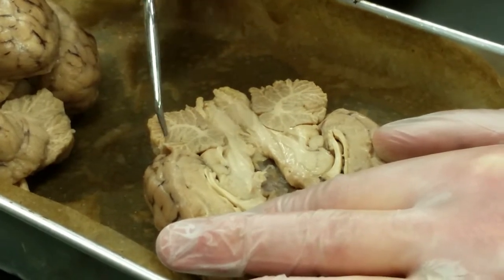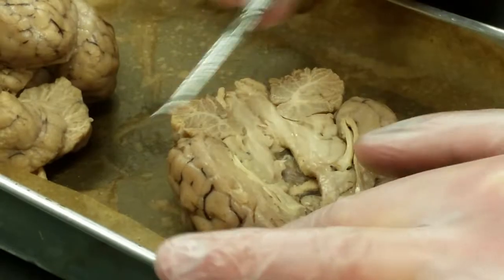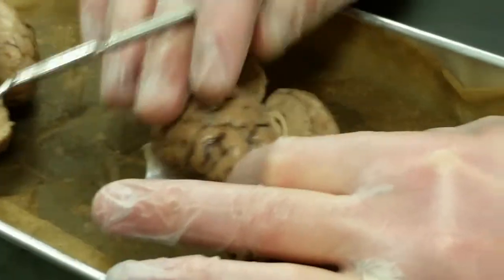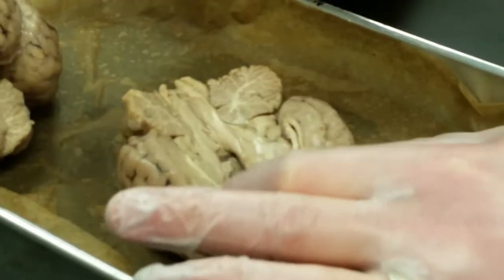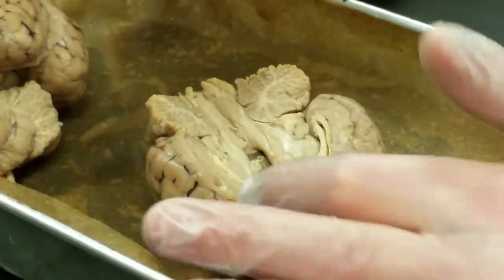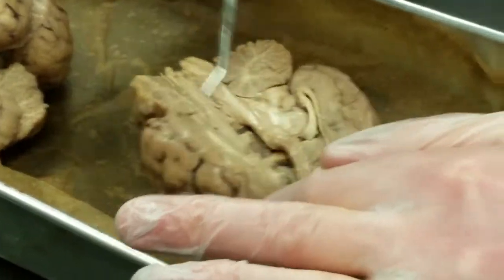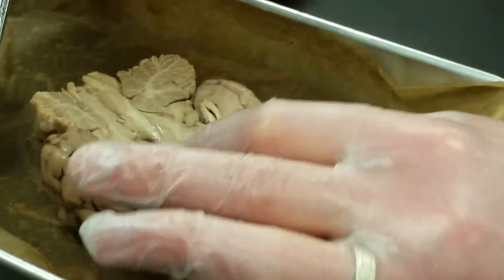It's fast relay. The gray matter is more of your learned memory stored here. So if we did a transverse cut here and looked at the inside of the cerebrum, we would also see that deeper is white, outer layer of the cerebral cortex is gray. So white, it's all about speed, gray is more for storage.